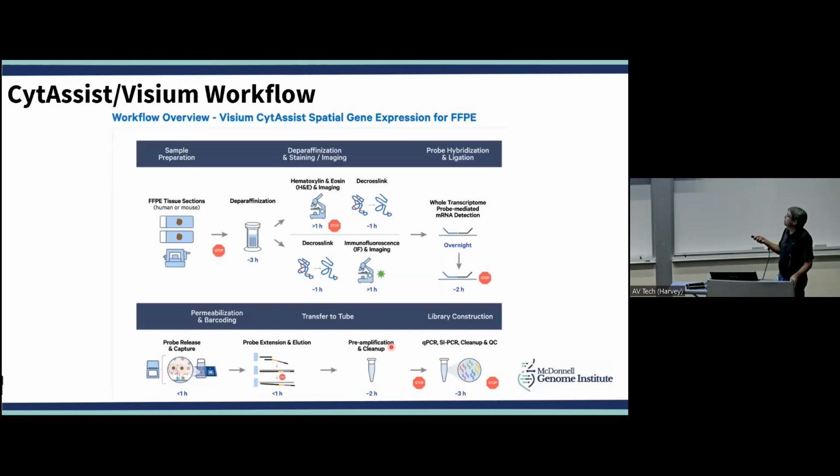Okay, so I'm not going to go through this in a lot of detail. This is the Visium workflow, or the basics of the Visium workflow. What you'll actually see is they're not all that dissimilar from the Xenium workflow, at least at a conceptual level. You go through a lot of the same or similar steps in order to get to the part where you're doing the run.